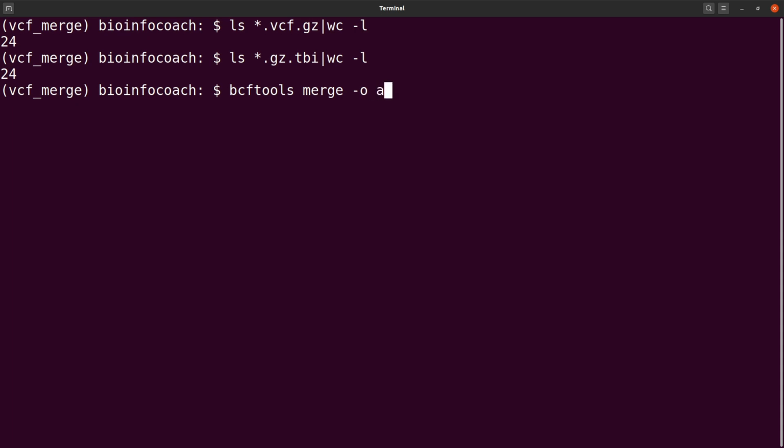So let's use all VCFs. Or let's just make it this way. Let's say merged VCFs. That would be better.